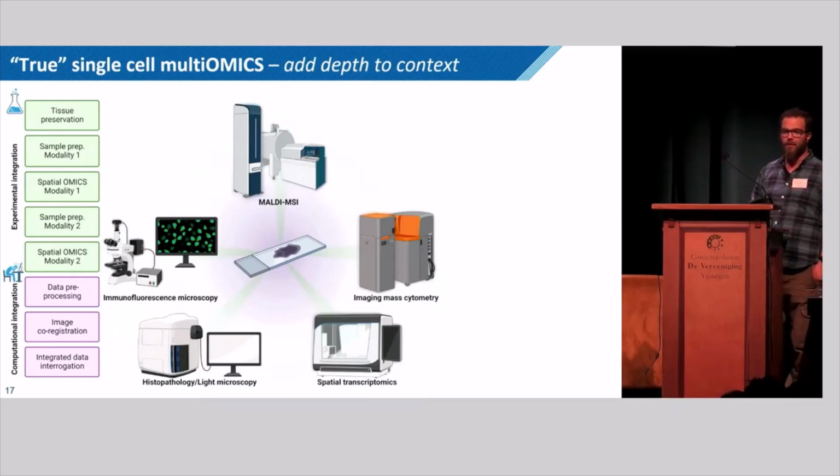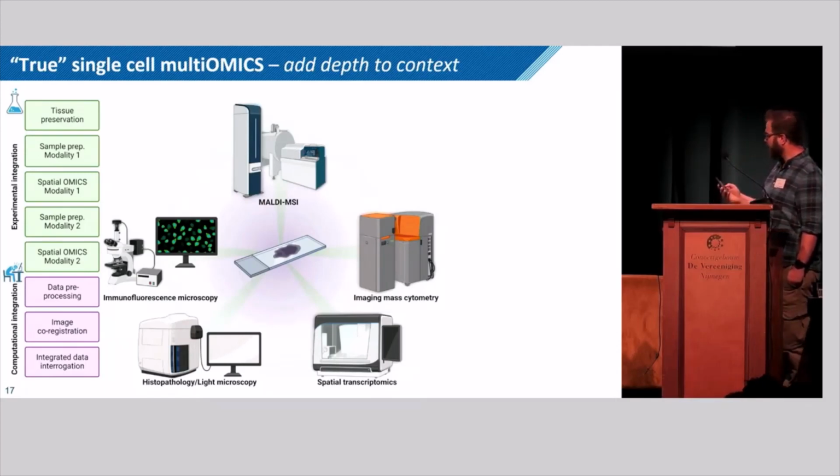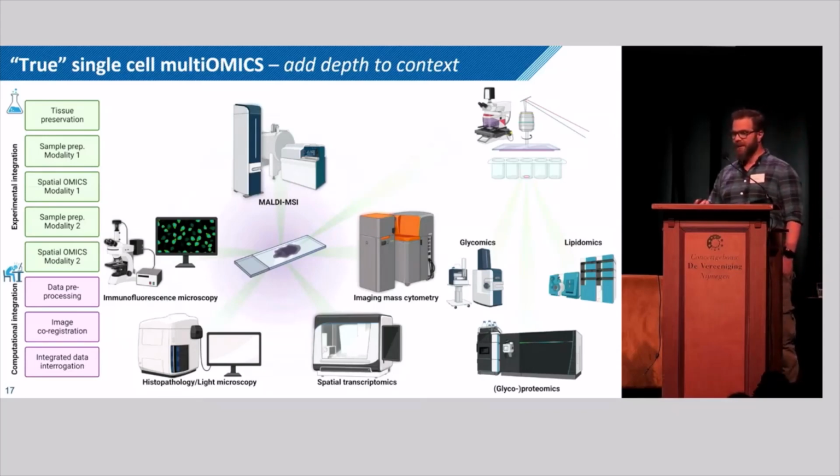the compatibility of all the different analytical approaches that we would like to look at. And I think the biggest challenge now lies not only in the successful integration of all the modalities, but in adding depth to context. Casper gave a very nice presentation before, showing that we should consider these microdissection approaches and subject them to very sensitive glycomics, lipidomics, and glycoproteomics approaches to add the relevant depth to the right context in which cells persevere.